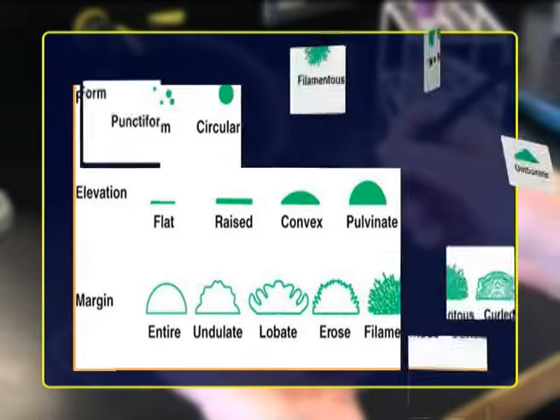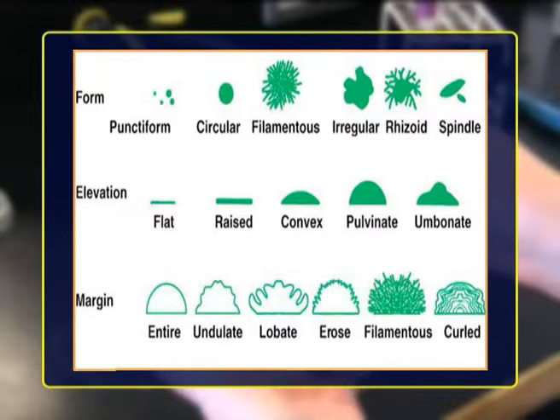Although some bacteria grow in distinctive patterns, others look alike. Colonial morphology, however, is influenced by the media and other growth conditions. The colonial morphology of the same bacteria may vary on different media or under different conditions.